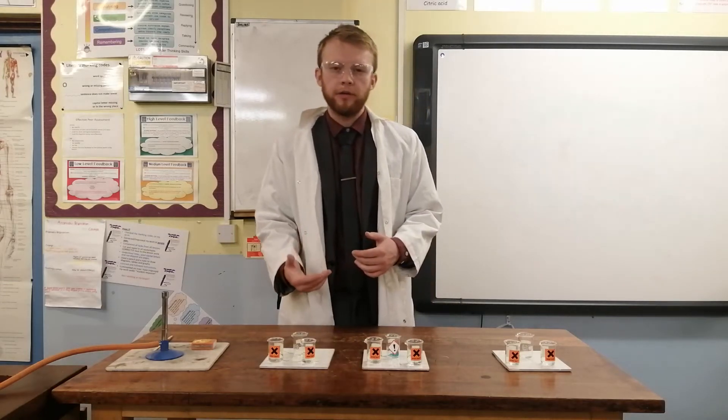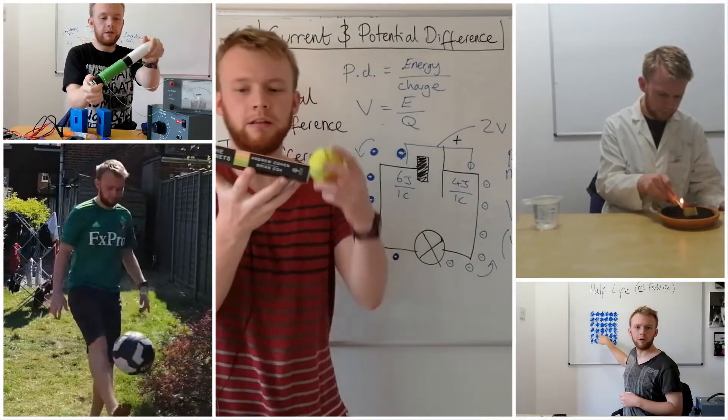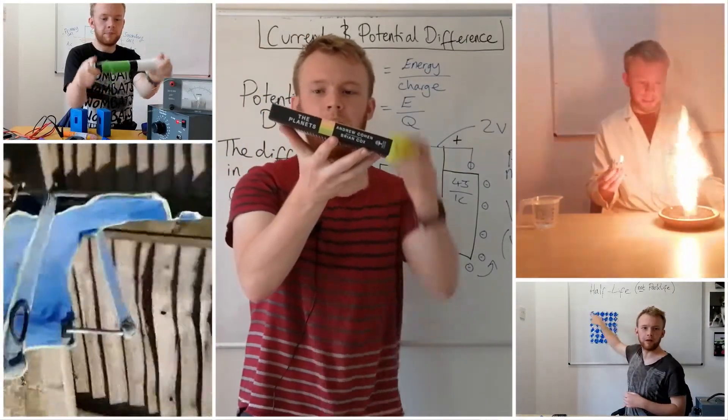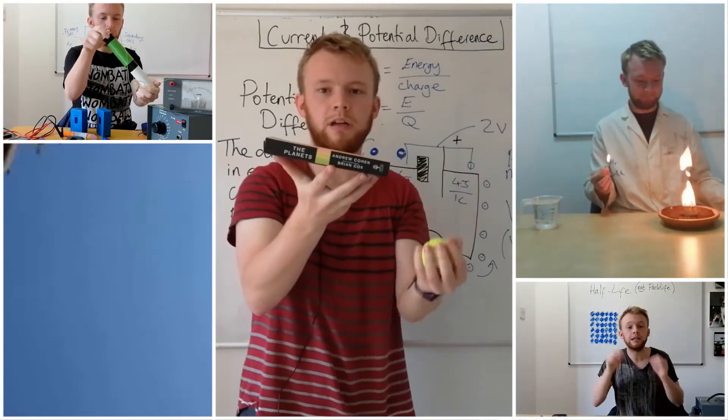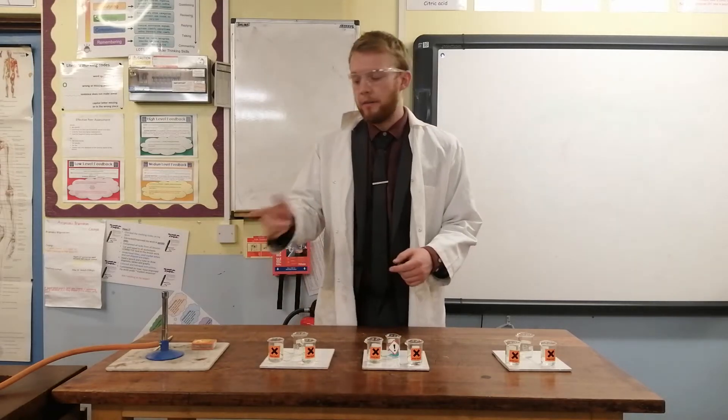In this video I'm going to show you how you can use a flame test to test for different metal ions, different cations. I've got some example metal ions here and I'm going to test them to see what colour they turn a Bunsen flame, to help me try and identify what metals they are. Now there's a specific procedure for that which I need to follow.